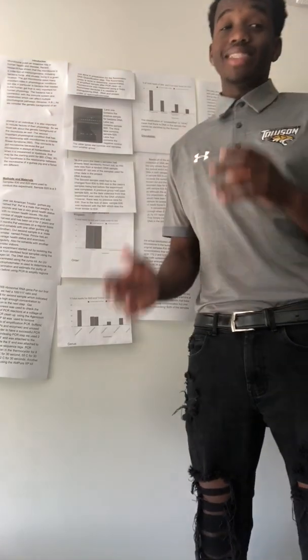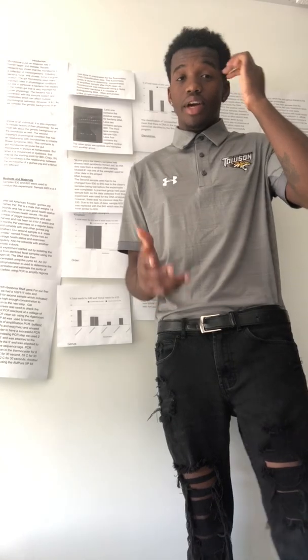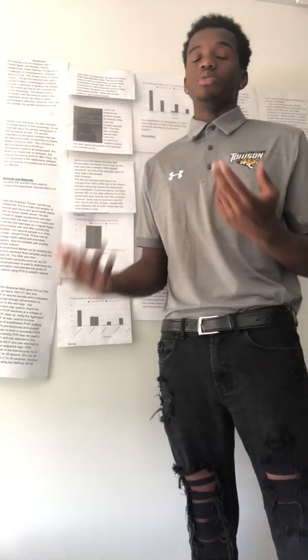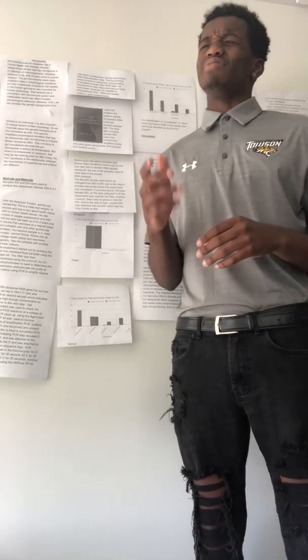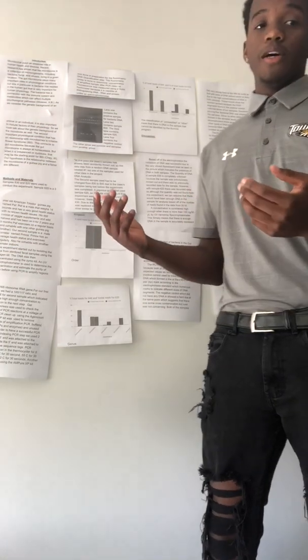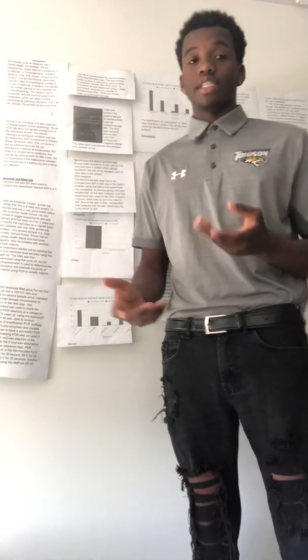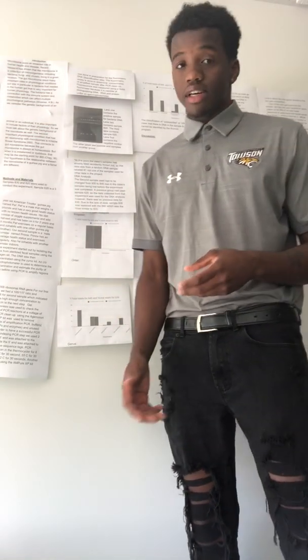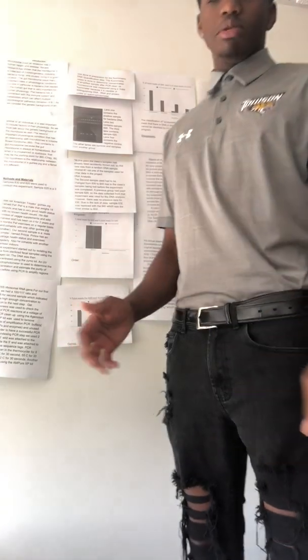The PCR reaction was successful with both samples, and their expected values and controls did as well. The positive controls had a 550 base pair mark according to electrophoresis, to let us know if there were different DNA segments. The negative control did not have any DNA, but showed a faded line that represented cross contamination, but not anything to be worried about.